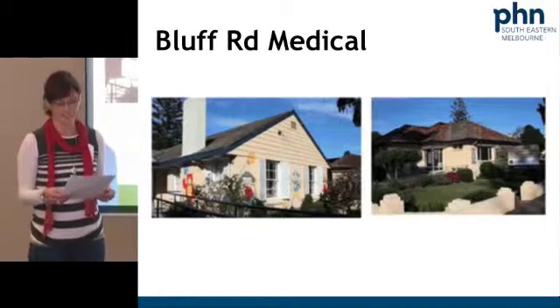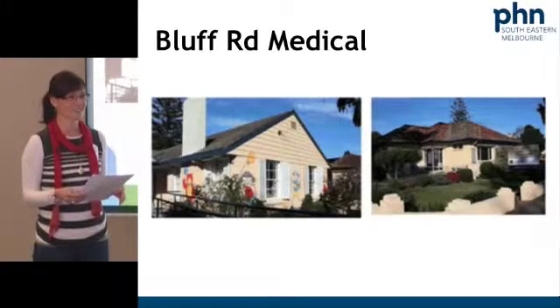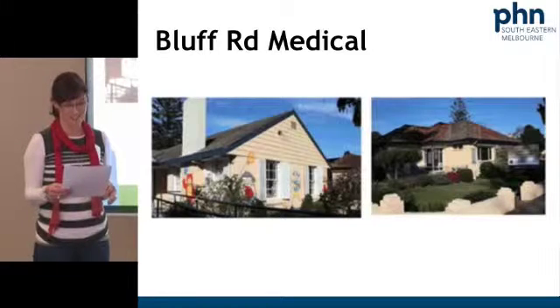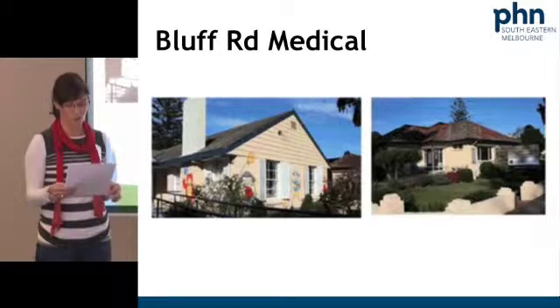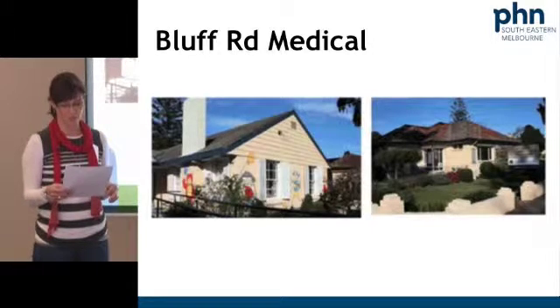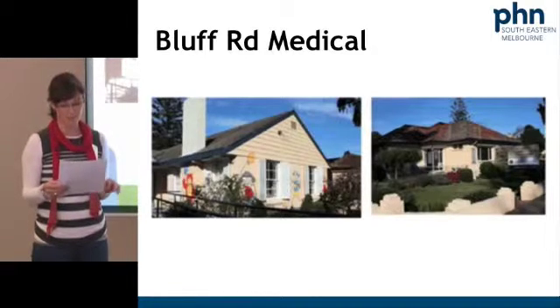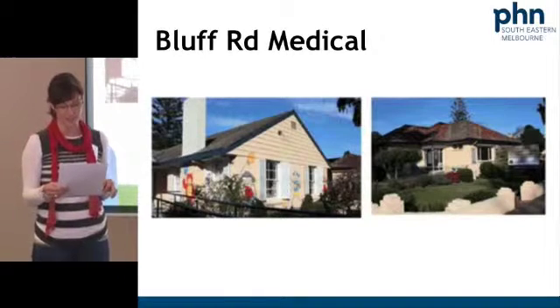He spent an hour with us, and on completion of the servicing of both these vaccine fridges, we were given a certificate of notice of non-compliance, stating that the vaccine fridges at Bluff Road did not comply with the standards of vaccine storage as issued by the Quality Care Pharmaceutical Program. The notice stated that both of the fridges have problems with the controlled refrigerator systems, and therefore they cannot be calibrated to correctly display the real temperature inside the fridge at any one time.